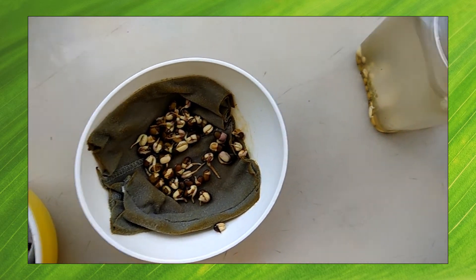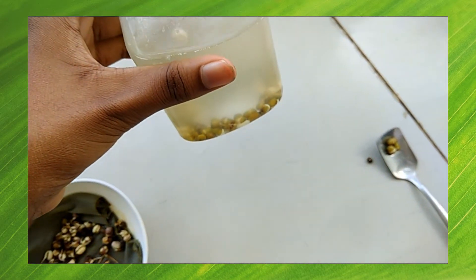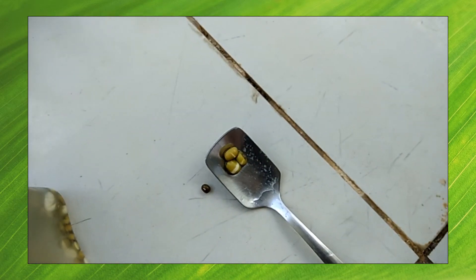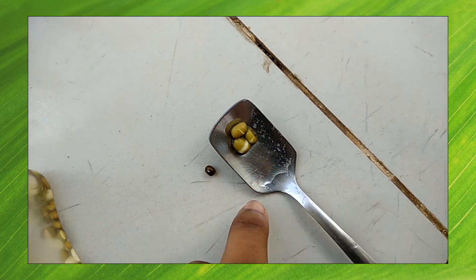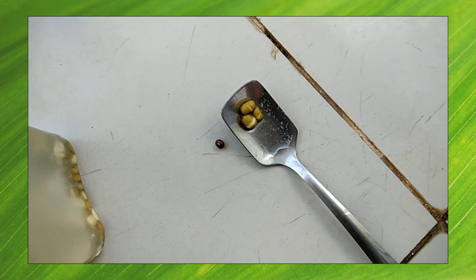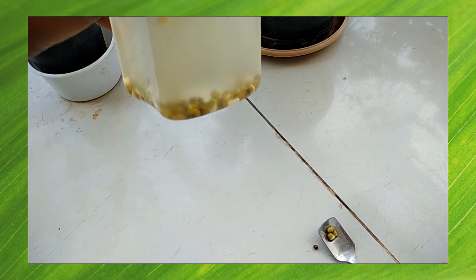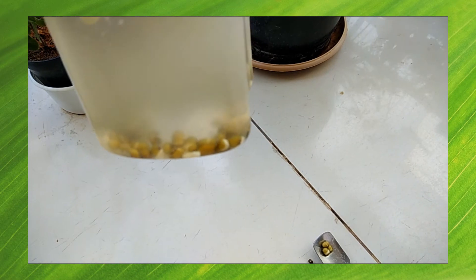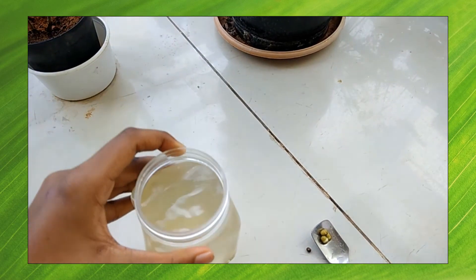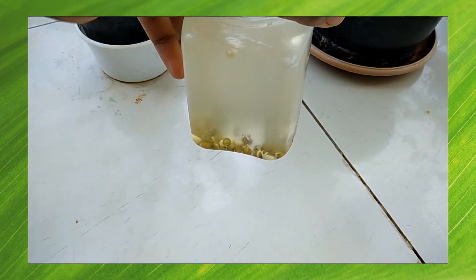The seeds in the second container had also swollen up. In the third container, where the seeds were completely immersed in water, I noticed that the seed coat was starting to come off and the seeds had swollen compared to their original size. However, radicle growth was present in only one or two seeds, and even then it was very minimal. In many seeds the seed coat had started to completely come off.